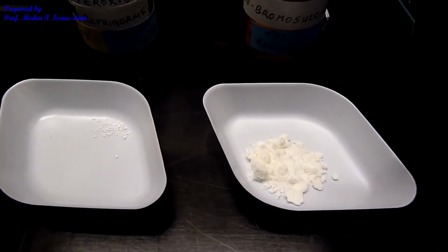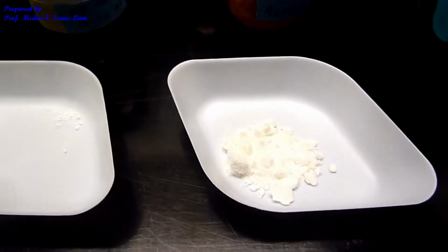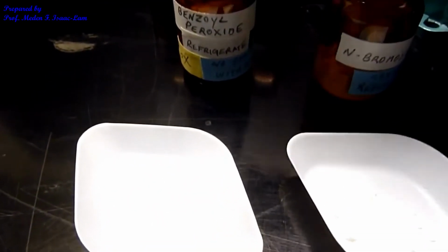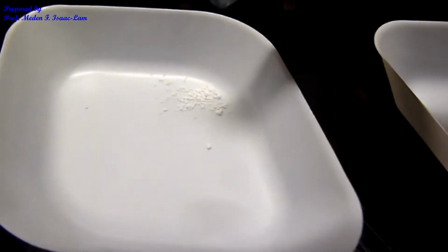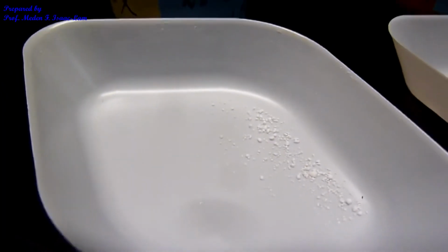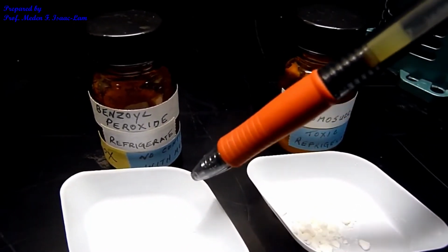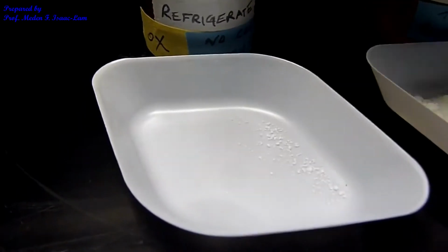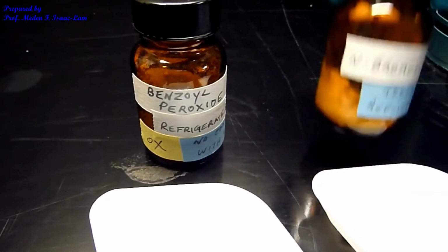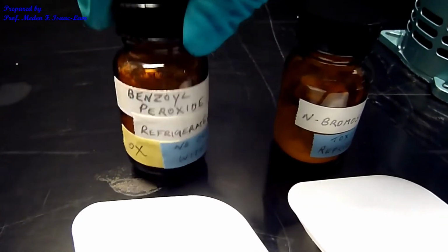This is now what I weighed. On the right side it's the NBS, and that's 0.620 grams. On the left side is the dibenzoyl peroxide, and you can see that it's a very small quantity. It's 10 milligrams. It's the initiator. So this is our NBS on the right side, 0.620 grams, and this is the dibenzoyl peroxide, 10 milligrams. N-bromosuccinimide is our brominating agent. The peroxide is the initiator.